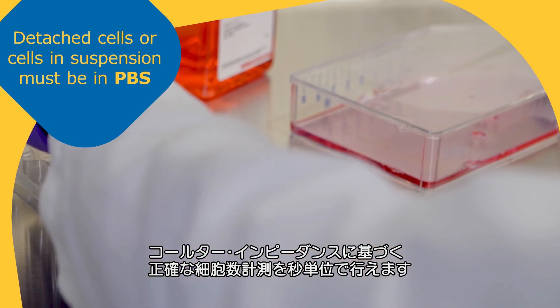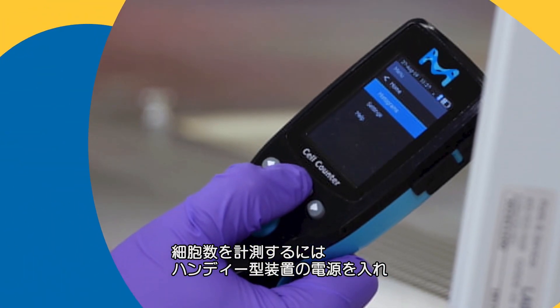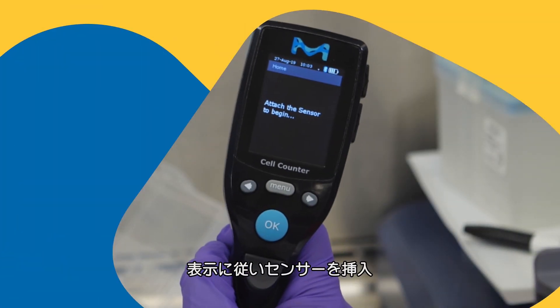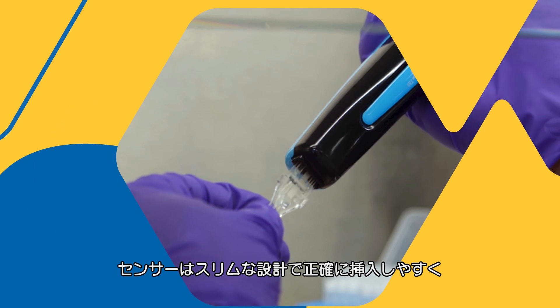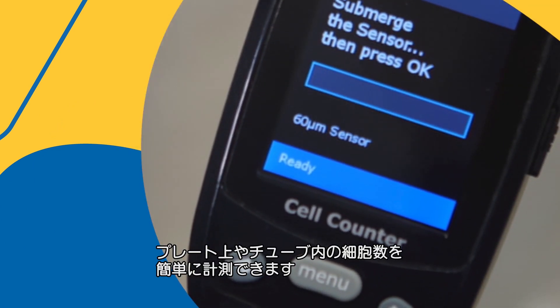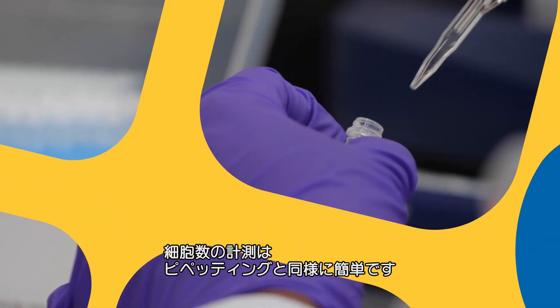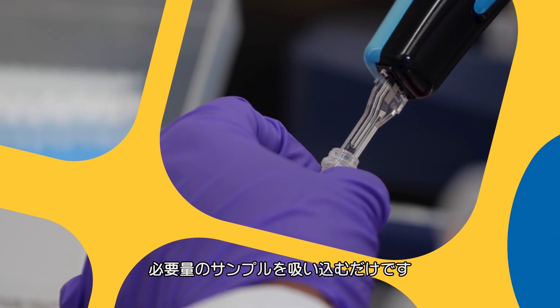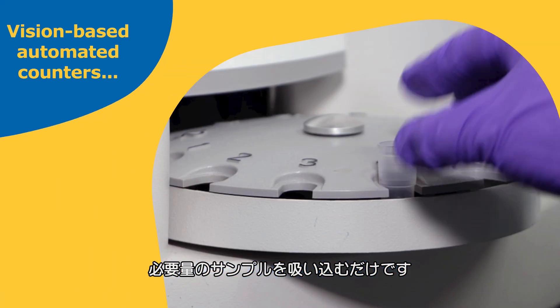When you're ready to count cells, simply power up the handheld instrument and insert the sensor when instructed. Streamlined sensor design guides correct insertion and makes it easy to count from plates or tubes. Obtaining counts is as easy as pipetting — simply insert the sensor into the sample and draw the sample into the instrument.